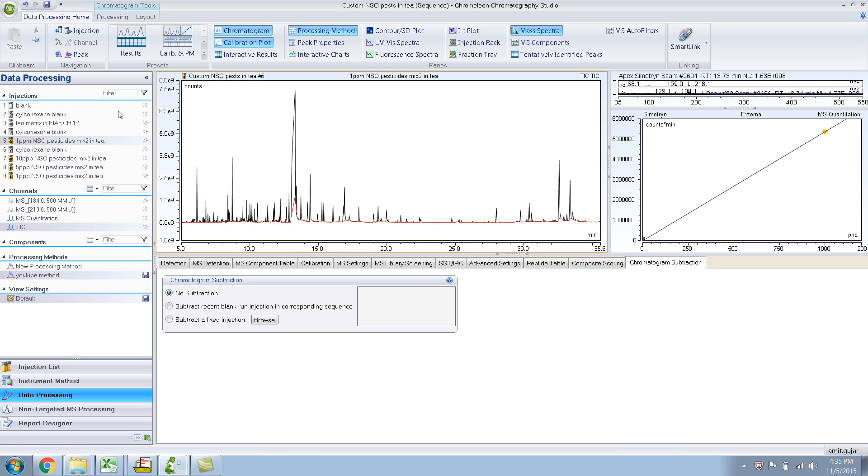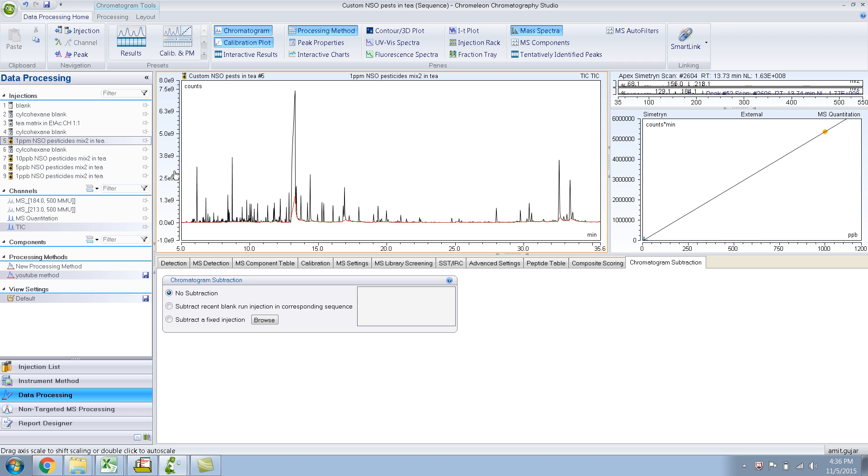This particular injection is like one ppm pesticides, NSO pesticides. But I also have NSO pesticides in T matrix, but I also have the T matrix itself. So if I subtract this from this, I should get the pesticides only. And that might be useful because there's a lot of peaks in the matrix and it can get a bit confusing to know which is pesticides.